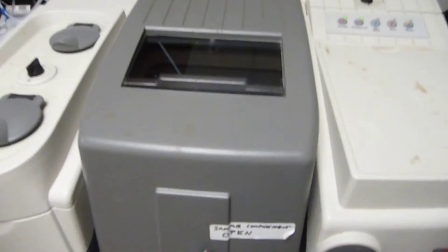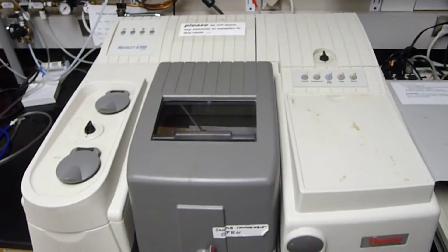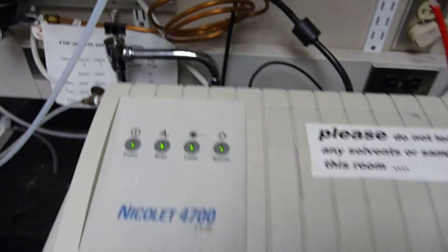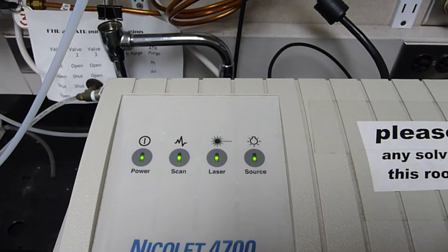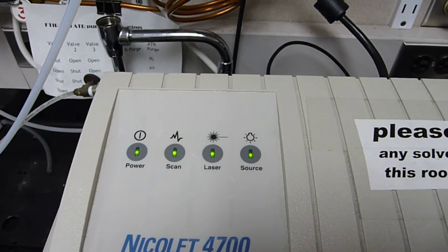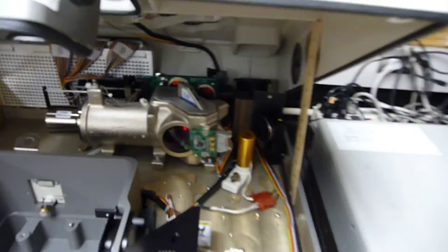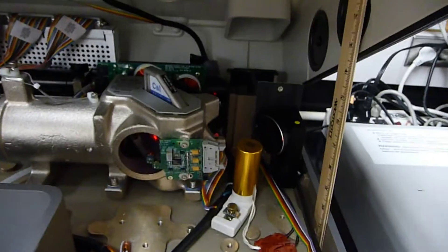Let's take a look at what the insides of this look like when it's powered up. Our status shows it's scanning, it's powered up, the laser's on, the source is up. Let's take a look — and this is with the cover propped open with that 12-inch ruler.